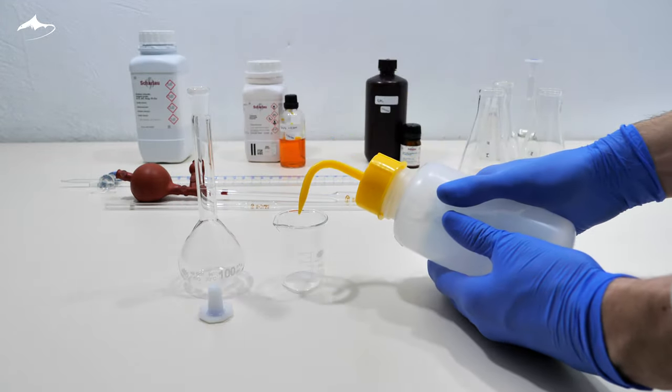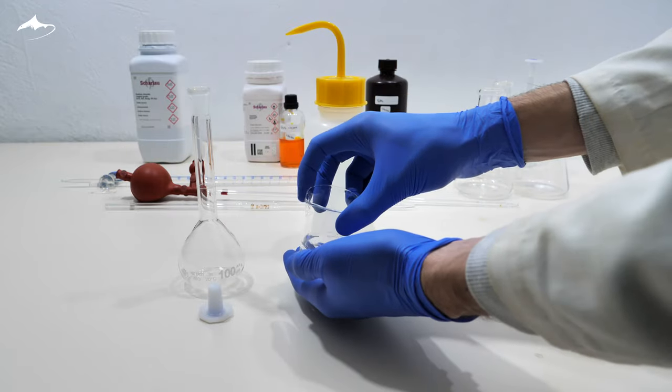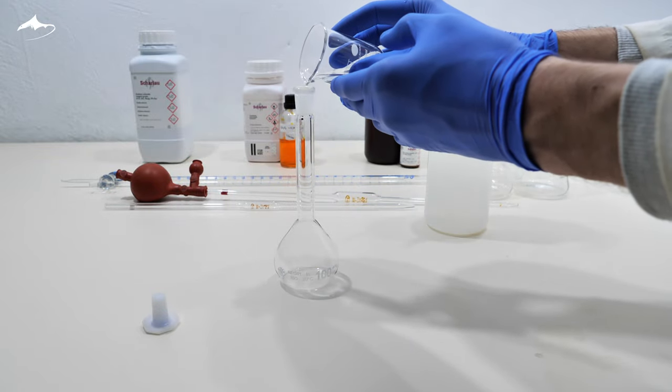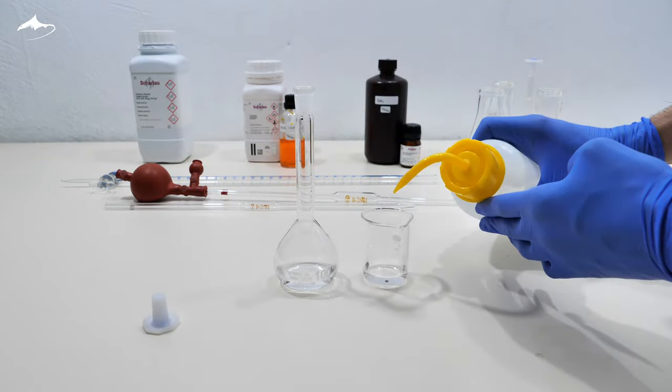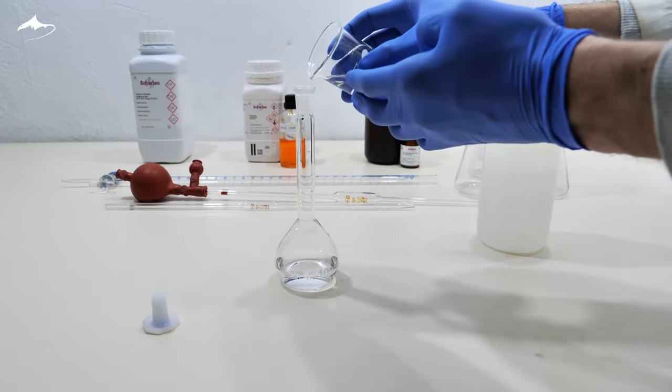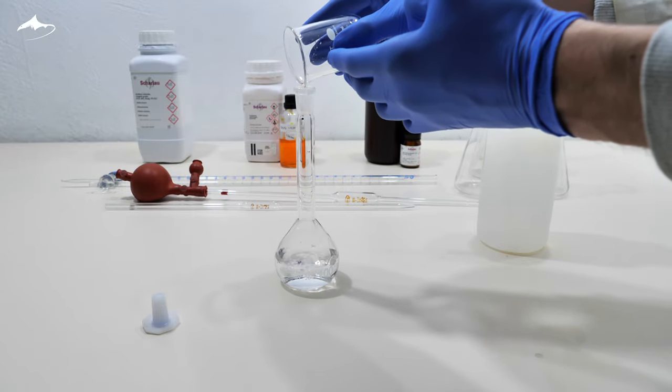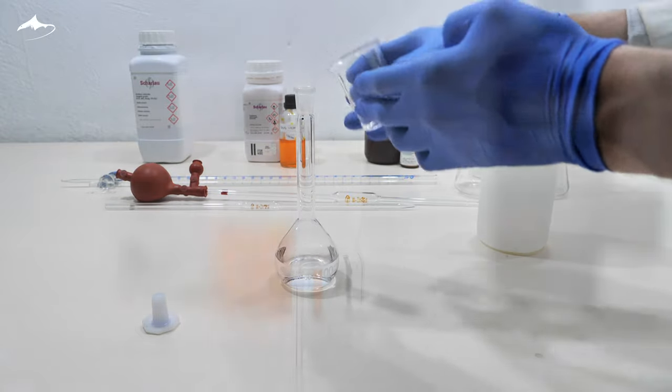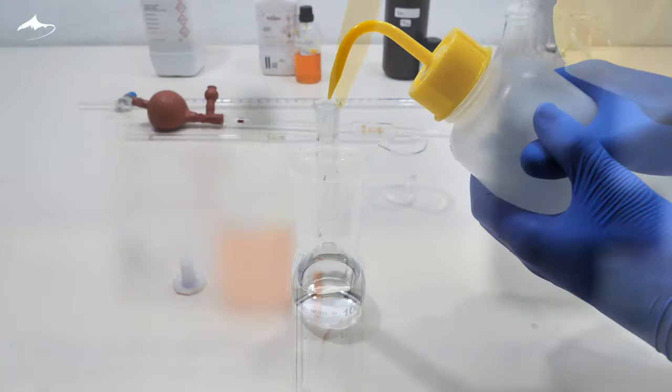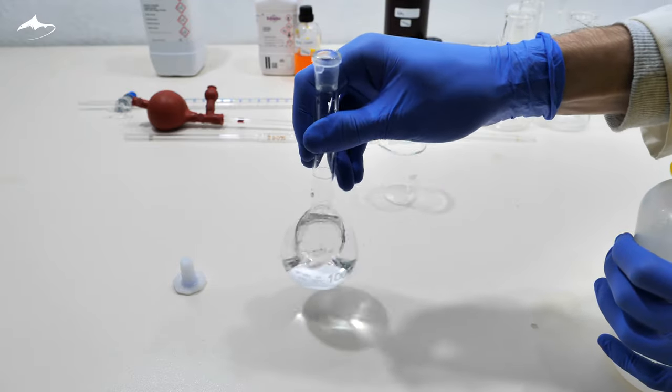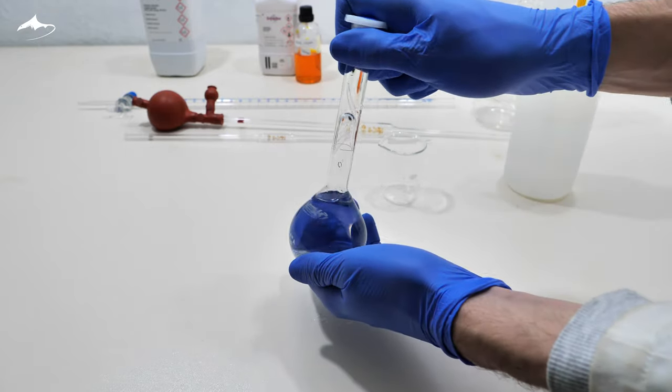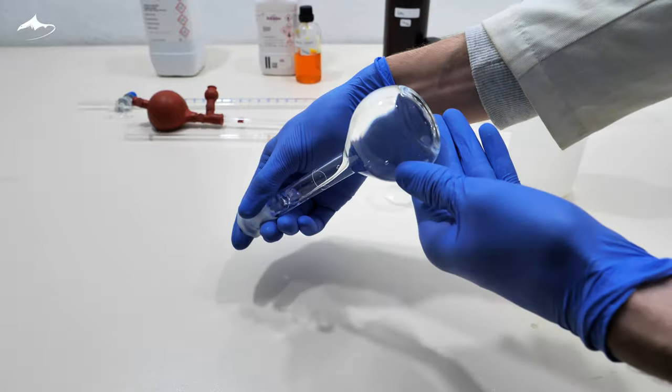Once weighed, the salt is dissolved in distilled water and quantitatively transferred into a volumetric flask. To achieve this, the beaker is rinsed several times to ensure all the sodium chloride is transferred. This is mandatory when preparing standard solutions, as this step is a source of analytical errors. After that, the flask is filled with distilled water up to the ring marking. Then, it is inverted several times to completely homogenize the solution inside.